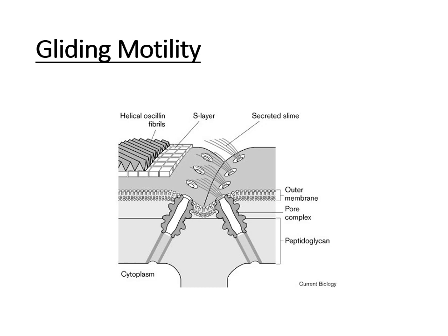Okay, so when you hear gliding motility, think a layer of slime secreted to slide across.